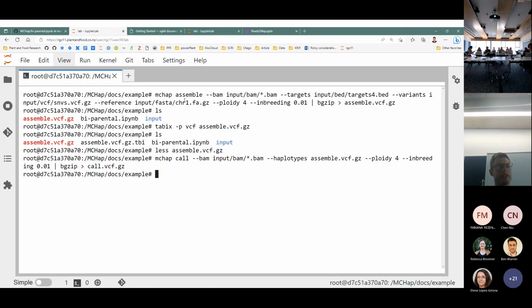This is still a bit unrealistic in this example because for those haplotypes that we have identified in the population, we're then saying that they're all equally likely to occur when we rerun it. There are more advanced options we can use to actually use the frequency of those calls from the original assembly in the downstream calling, which we won't have time to do today. But a lot of this two-step approach is about trying to refine a more realistic prior distribution, or prior probability, for your haplotypes.